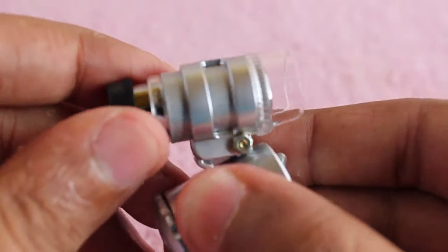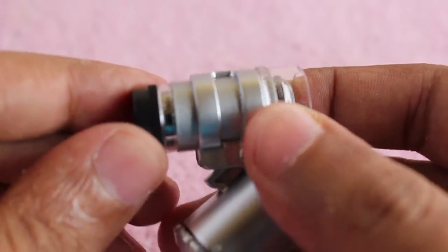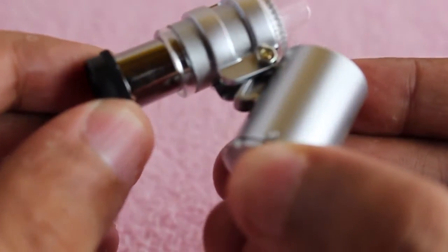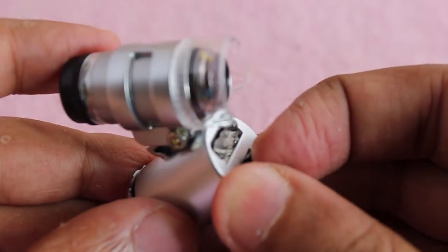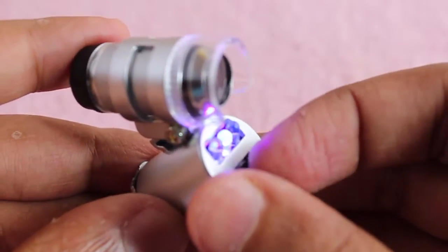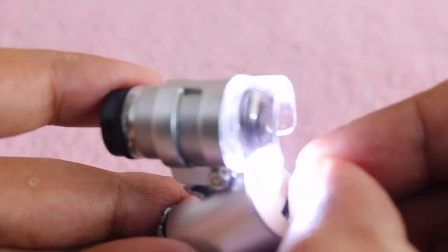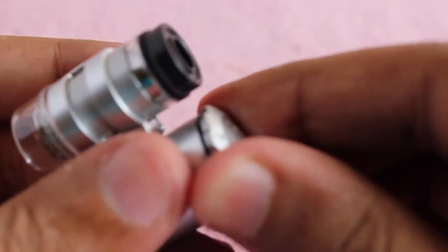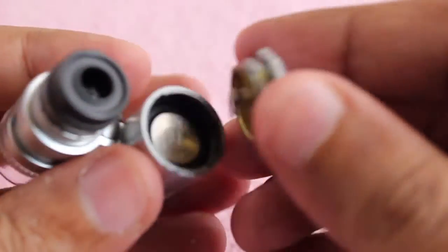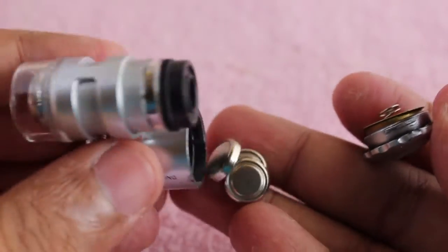You flip it out like that in order to use it, and you can adjust the focus by moving the lens. It even has an ultraviolet light and a regular LED light. That's also where the batteries go for the light, though it works without the light too.